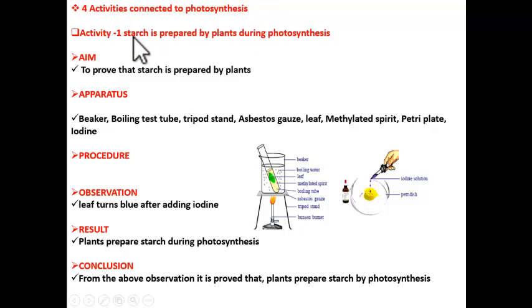The first activity is to prove that starch is prepared by plants during photosynthesis. How can we prove that in our lab? There is a simple test for starch. If we add iodine solution to any starchy substance, that will turn blue. So turning of a substance into blue color is an indication that the substance contains starch.